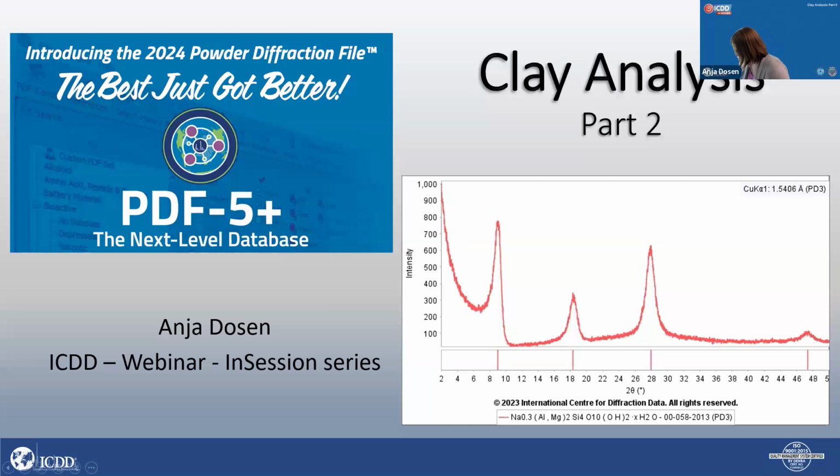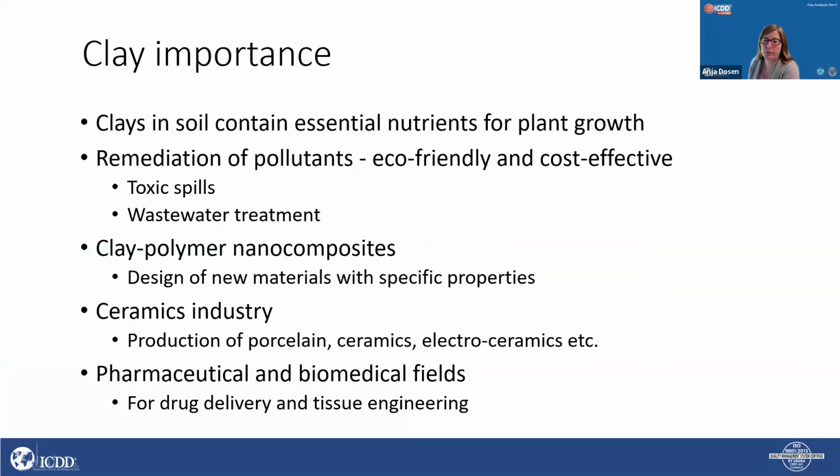Hi, everyone. Welcome to Clay Analysis Part 2. This time I'll be talking about some more details related to clay mineral analysis using X-ray diffraction and using our PDF database 5+ and Jade. So I'm going to go through some of the intro to clay that we've talked about last time, but I'm just going to run through it as a reminder, starting with the importance of clay.